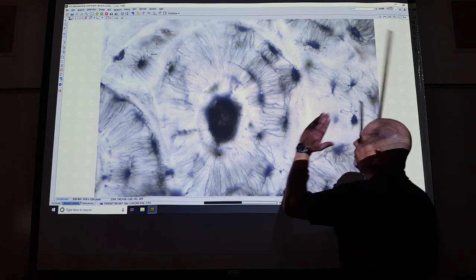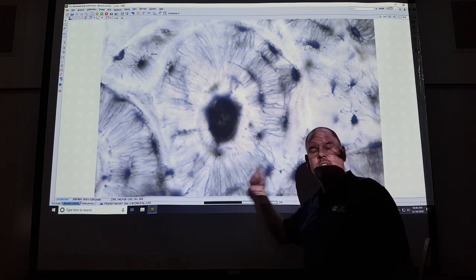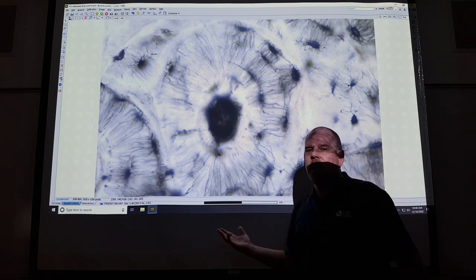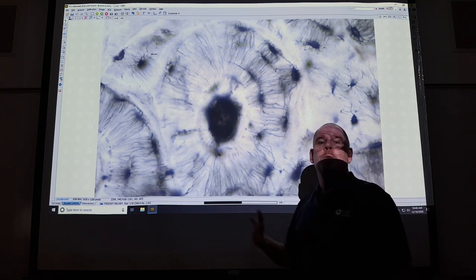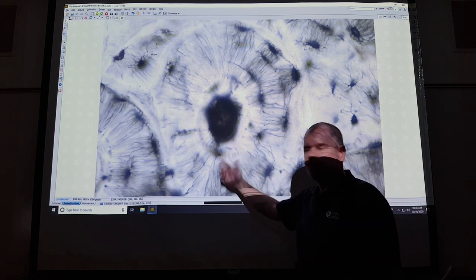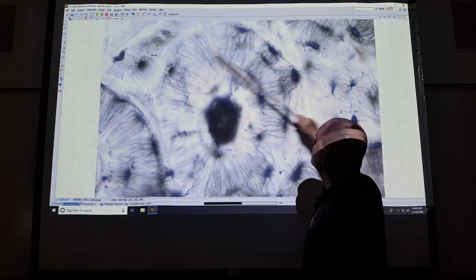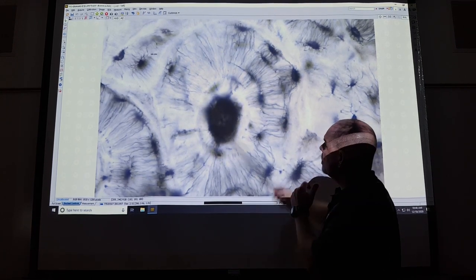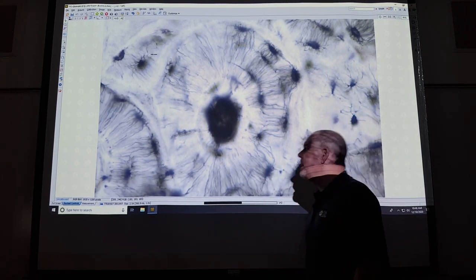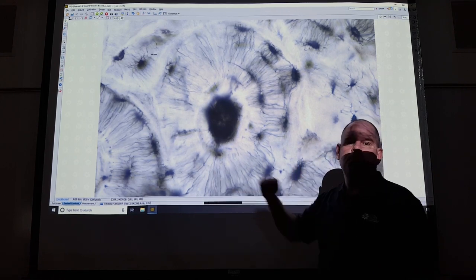For lab, name the tissue, bone. Classify the tissue to its type, connective. Where do I find it? You only have 206 potentially correct answers. Your skeleton. And what are these? Osteocytes. What's the whole target? Osteon, and the bullseye again, central canal. Very, I think, easy tissue to identify. Dense bone.